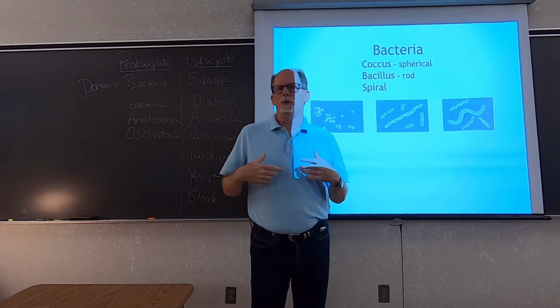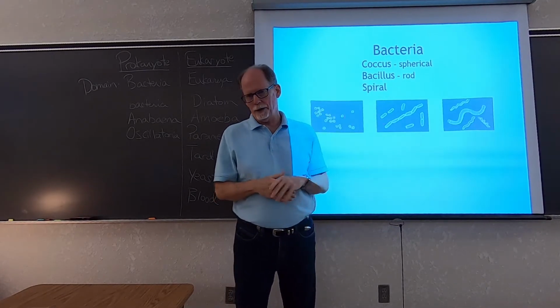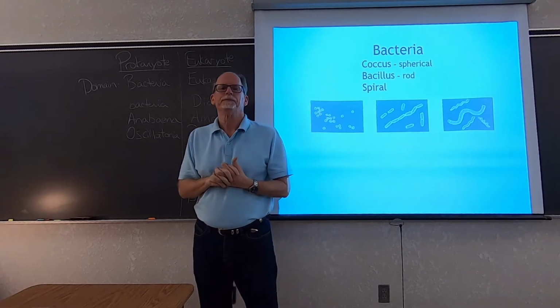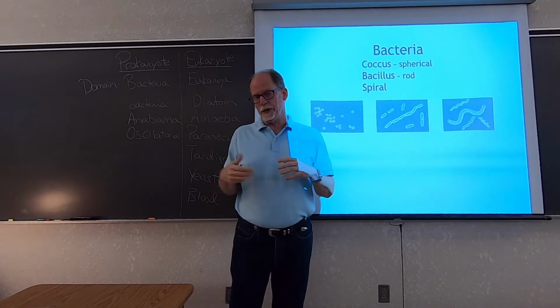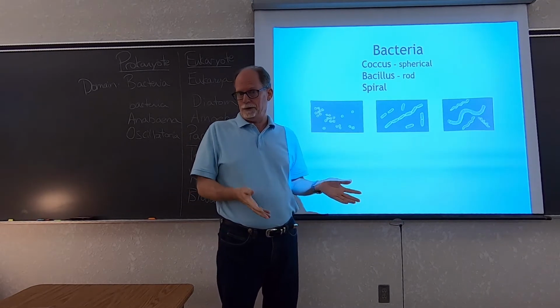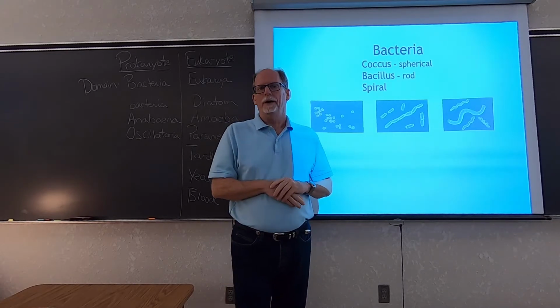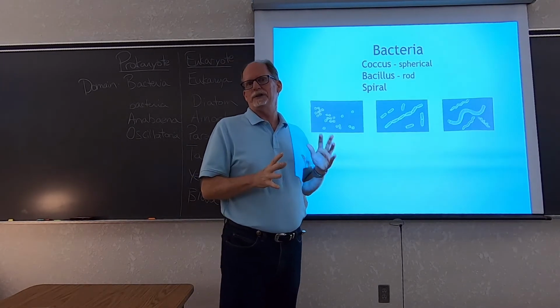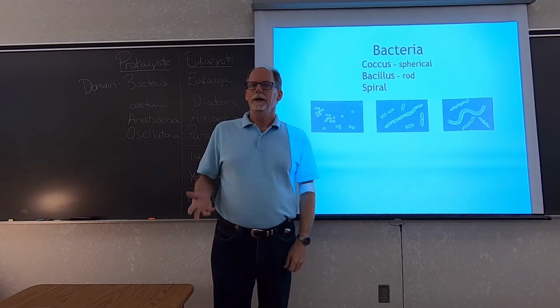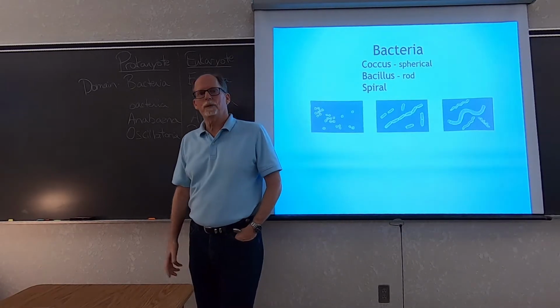The cell lab, we would normally for this lab be looking in the microscope at images like bacteria or diatoms, amoeba, paramecium, and hopefully it would help you learn the names and get a rough idea of what they look like. And then if we did this lab practical in the lab, you would look in the microscope and have to identify these. So when you take the practical, instead of looking in a microscope, you'll be looking at maybe a figure from this PowerPoint and telling me if it's the diatom, paramecium, tardigrade, whatever organism it might be.